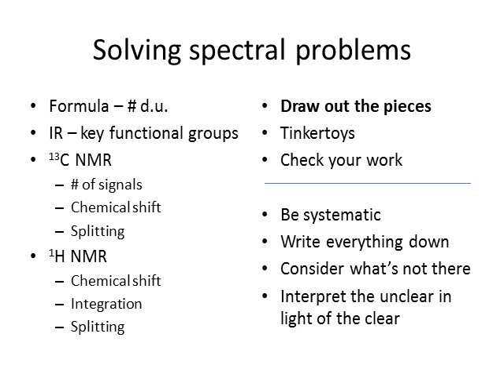And then finally, if it's available, I will go through each of the signals and see what splitting information tells me. Again, I'll often write it directly on the spectrum or to the side in a set of notes. I'll say the signal at 40 represents a CH3, and the one at 50 represents a CH2, and the one at 100 has no hydrogens, or whatever.